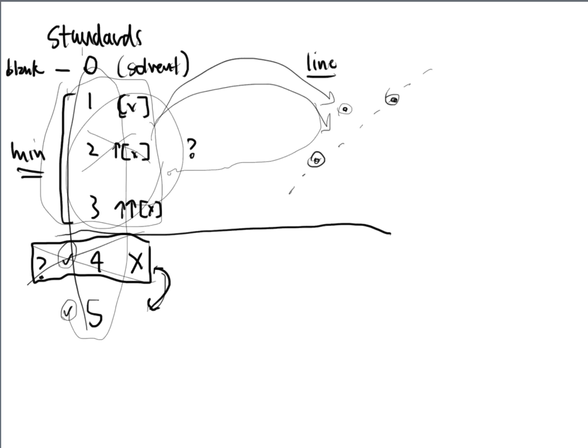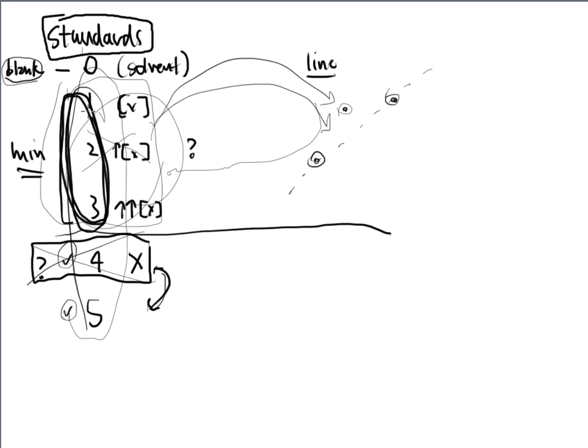So this is where we left off, and we were talking about calibration curves, at least the intros to it, and we said standards were very important in the laboratory. And standards should always include a blank and minimum 3. 3 standards are the minimum, but we encourage you to go up to 5 standards. That way, if you mess up on one of them, we can just delete it from the set, and you've got 4 really good standards that you can still use in your calibration curve.